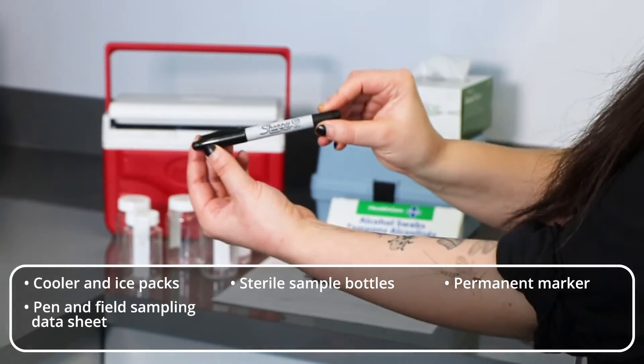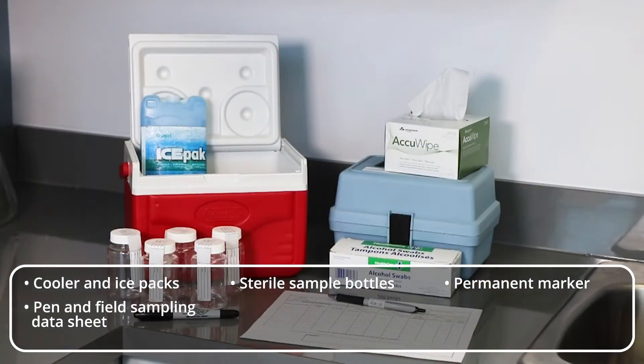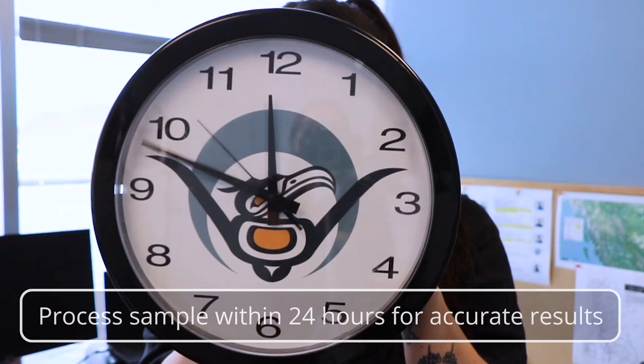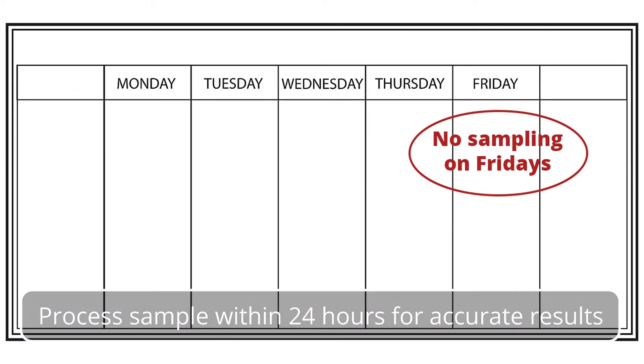For example, record the sample site, location of sample, date and time of sample, free chlorine residual and total chlorine residual. You will also need a chlorine testing kit, lint-free cloth or wipes, and alcohol swabs or bleach solution. Please know your samples will need to be processed within 24 hours for accurate results. Plan your sampling accordingly.